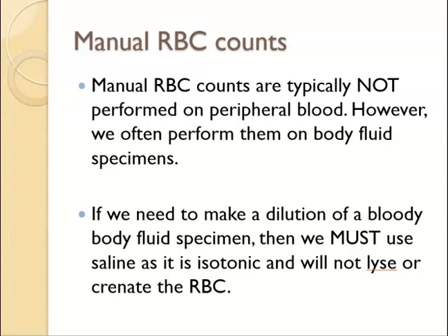If we do end up needing to make a dilution on a body fluid specimen, we must make sure that we use a saline that is an isotonic solution so our red blood cells do not lyse. Also, we don't want crenated red blood cells. We want our red blood cells nice and happy so that they're easy to count. If our red blood cells lyse, we're not going to get an accurate count, and we're not going to have accurate results for our patients for a red blood cell count.